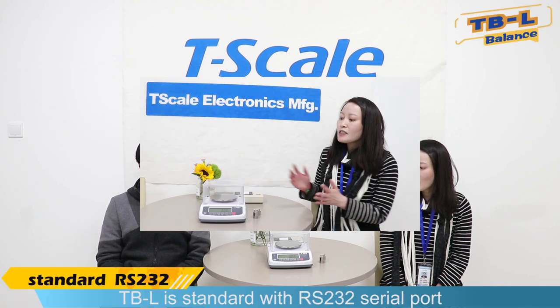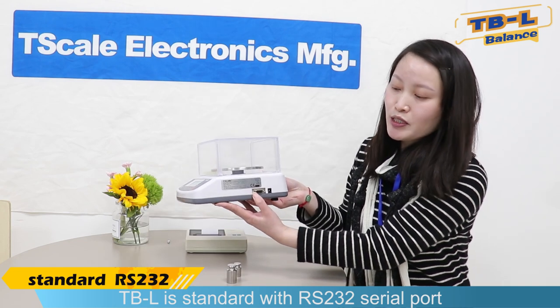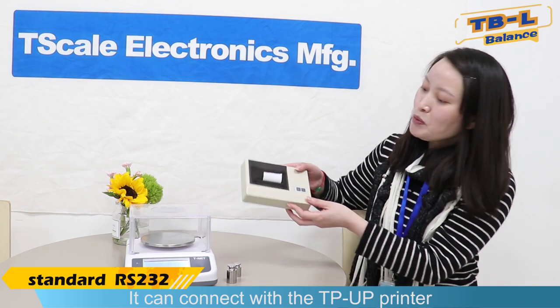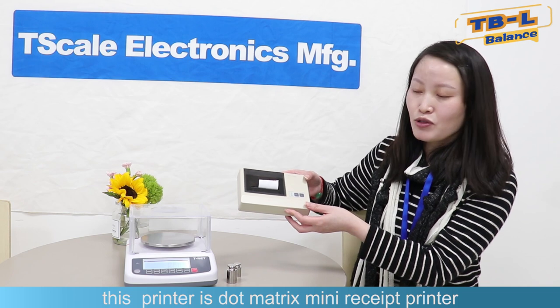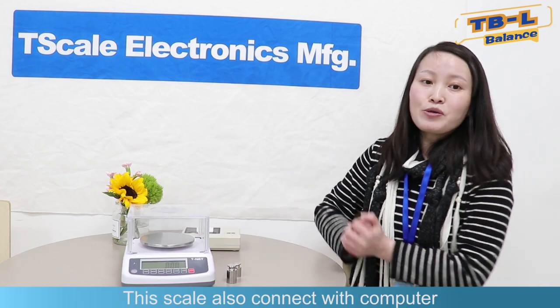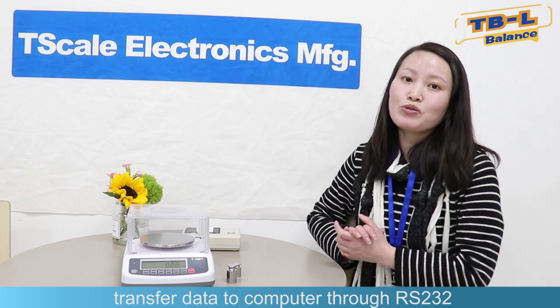What kind of printer can the TBL connect with? The TBL is standard with an RS-232 serial port. It can connect with the TPUP printer, which is a dot matrix receipt printer. This scale can also connect with a computer and transfer weighing data to a PC through RS-232.